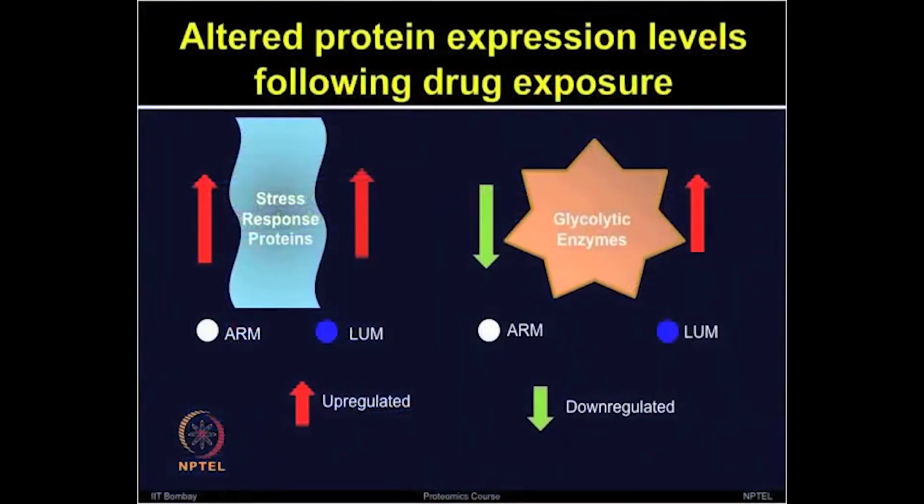The expression of the same enzymes was also upregulated more than threefold due to the lumefantrine treatment. However, the stress responsive proteins like heat shock proteins were commonly induced by either of these drug treatments, which looks like a general stress response as compared to any unique response to the given drugs.